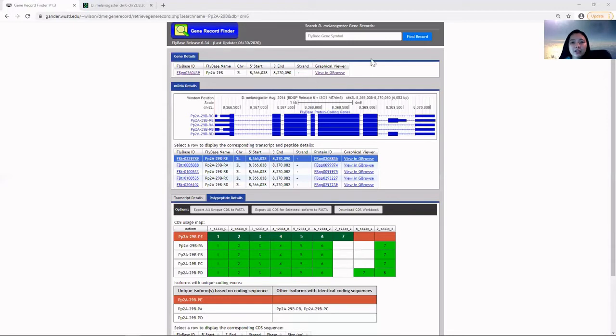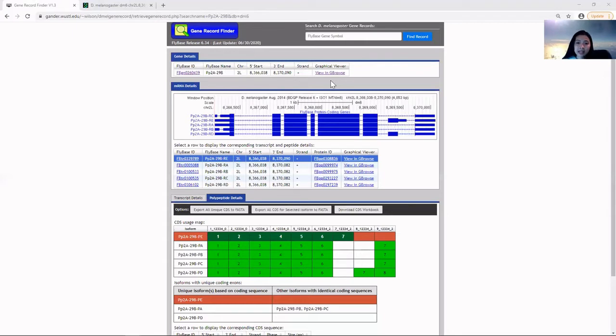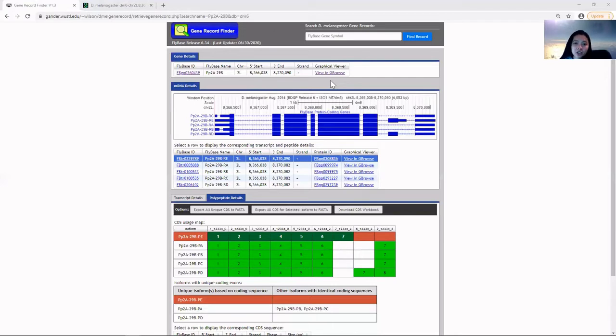The FlyBase GBrowse provides a graphical or tabular representation of the gene sequence in Drosophila melanogaster. These features include genes and their isoform transcripts, insertions, RNA-seq data, and orthologous regions in other Drosophila genomes.